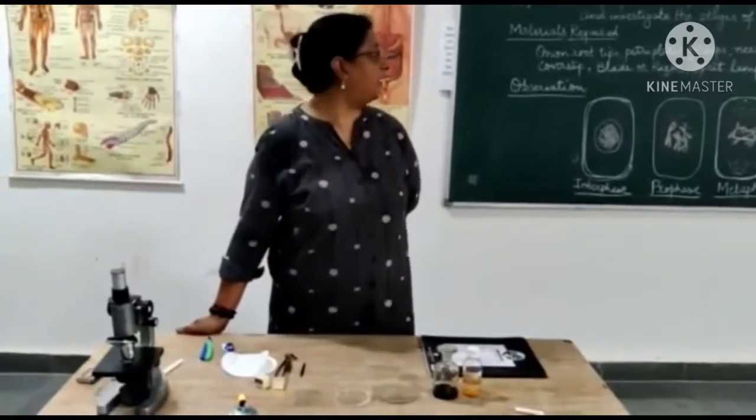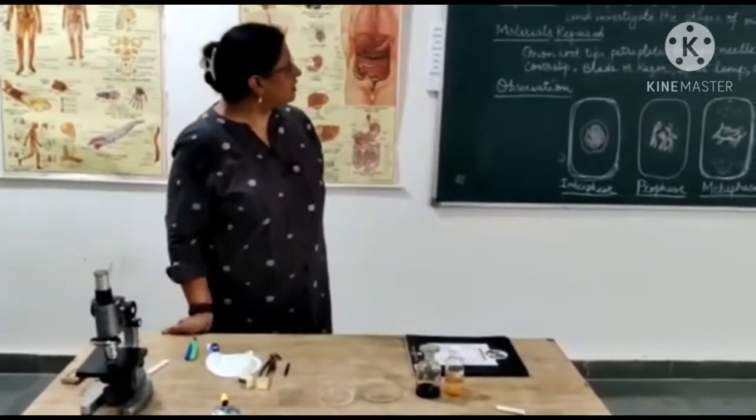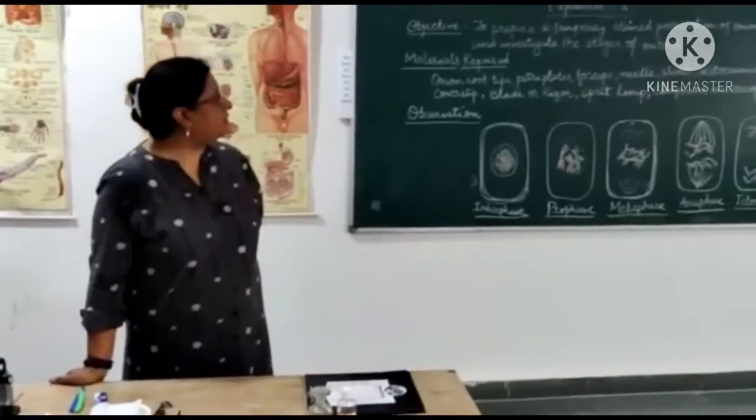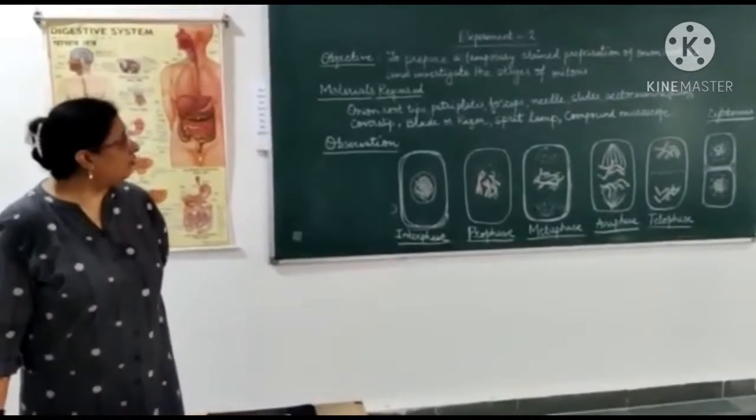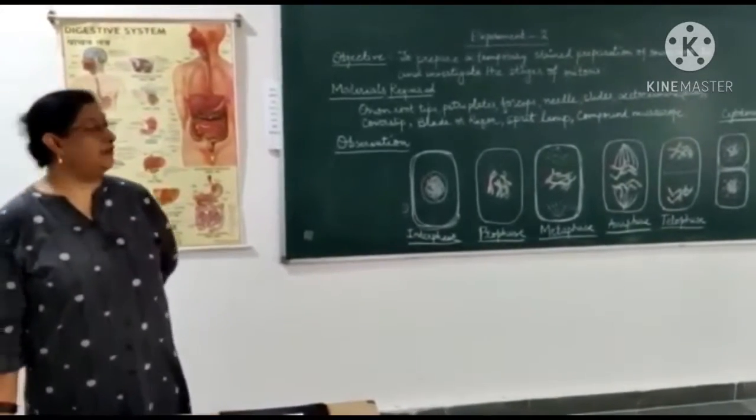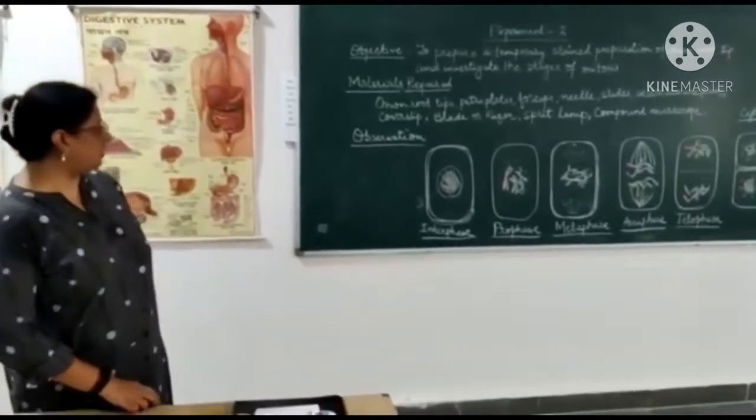Today we are going to do the practical, which is to prepare a temporary stain mount of onion root tip and investigate the stages of mitosis.